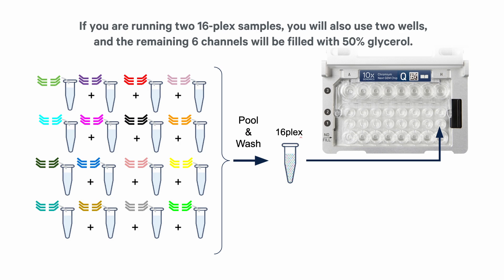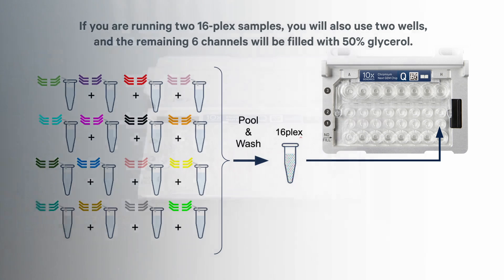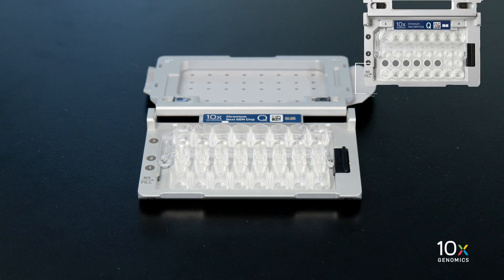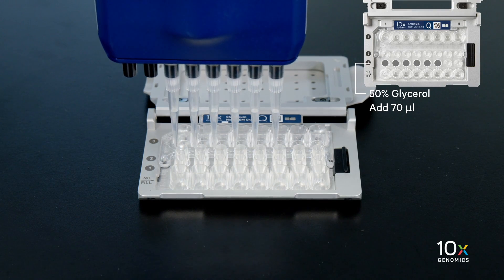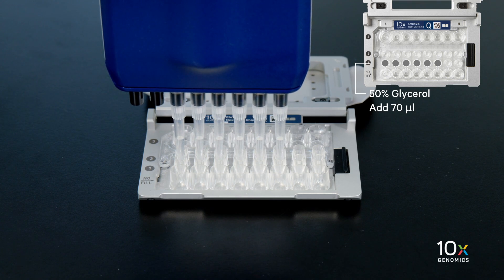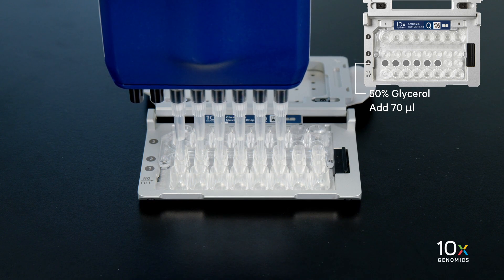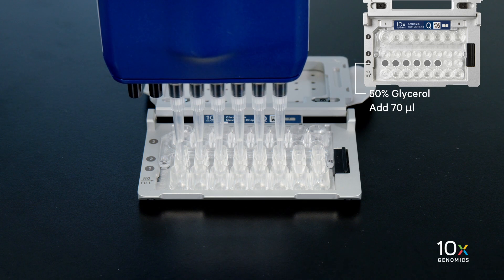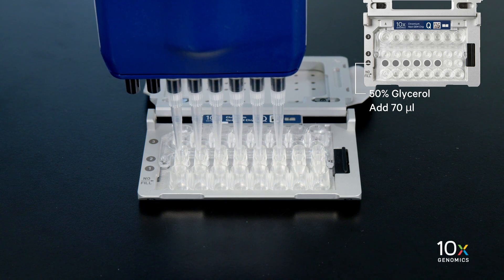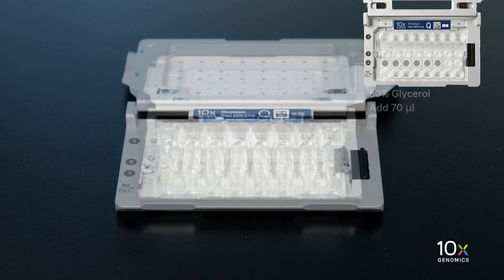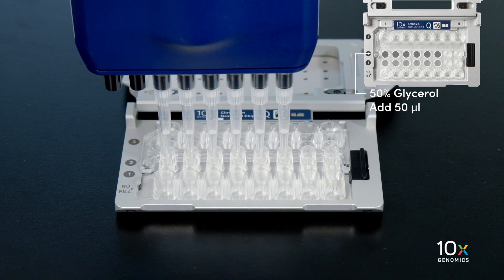The remaining six channels will be filled with 50% glycerol. We will add 70 microliters of 50% glycerol to unused wells in the row labeled one. When you pipette into the chip, gently touch the pipette tips on the bottom surface and slowly pull up the pipetter as you are dispensing. Next we will add 50 microliters of 50% glycerol to unused wells in the row labeled two.